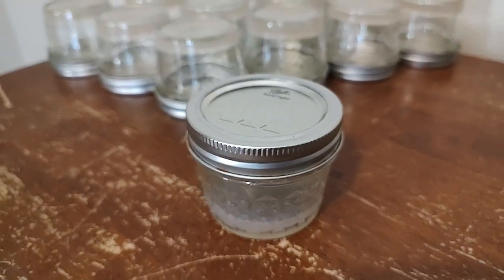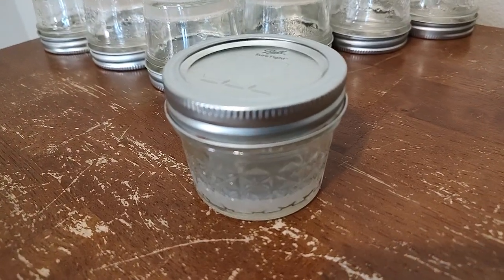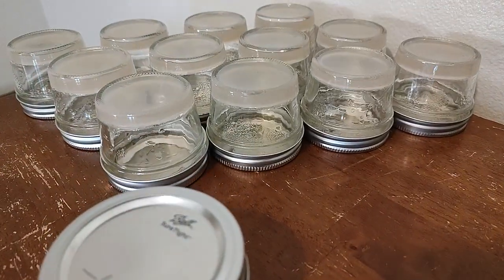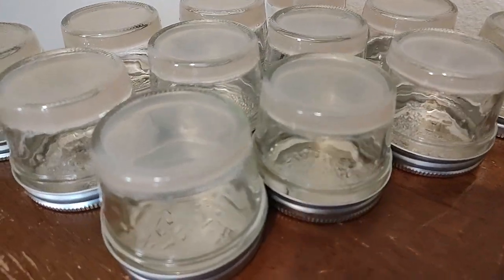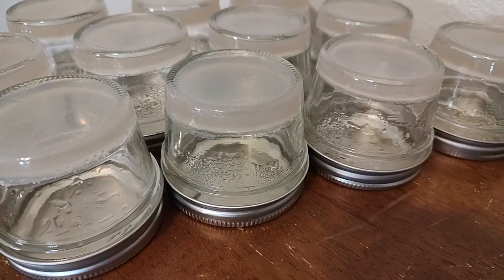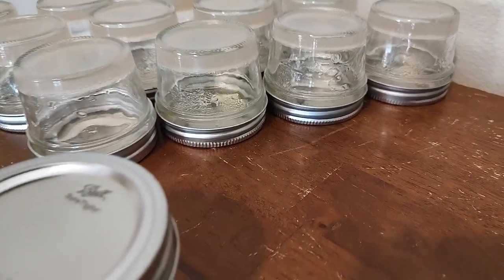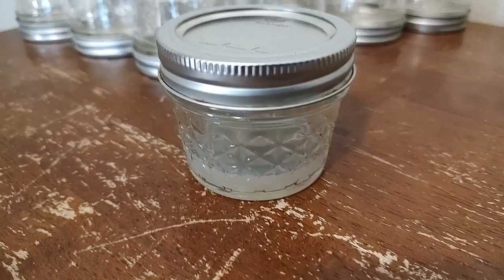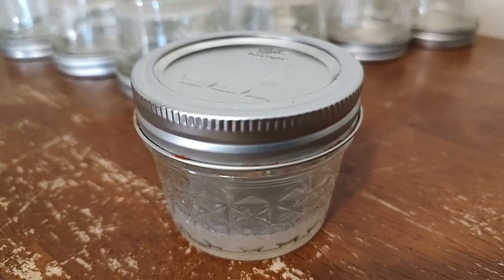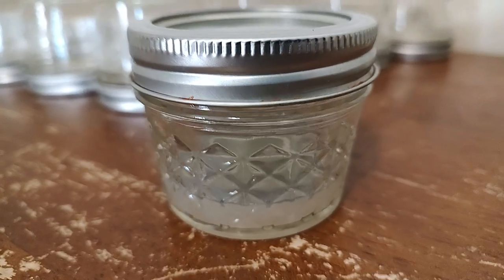Agar jars are simple and easy when you work through all of the details for yourself. I just wanted to chat about the lids. We love making these short topical videos because all the little things add up in mycology — like sterilization, keeping things clean, it really matters. So the lids being flipped is a great conversation when it comes to moisture in your no-pour jar.